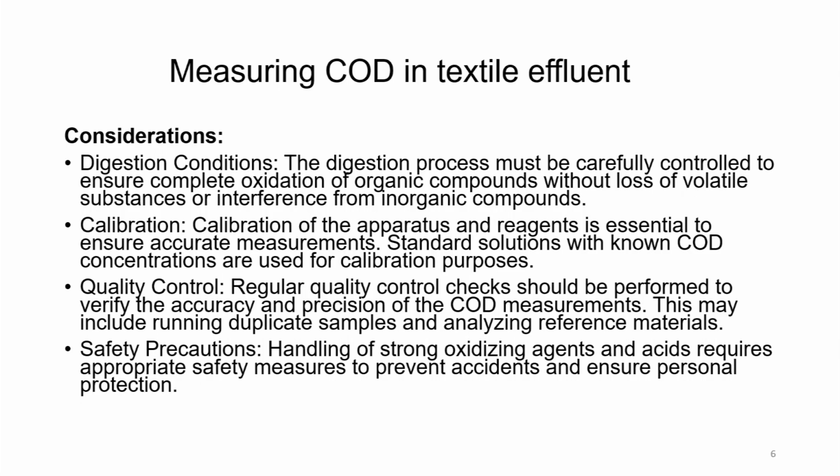Calibration of the apparatus and reagents is essential to ensure accurate measurements. Standard solutions with known COD concentrations are used for calibration purposes. Quality control. Regular quality control checks should be performed to verify the accuracy and precision of COD measurements.